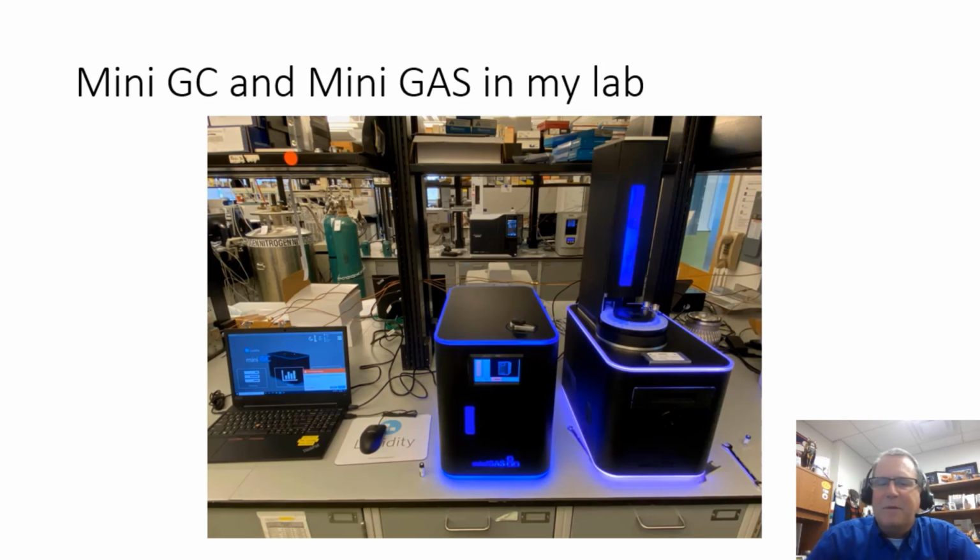I'm going to make a constructive criticism with a smile, for Lucidity and CEM. The box is black, and we do talk about black boxes a bit in the educational world. Let's not turn GC into quite a black box just yet, but they are pretty good. The black box is performing quite well. And I'll say one thing also with a smile, the students love the LEDs and the colors and all of that with the GC. Students are pretty excited about that.